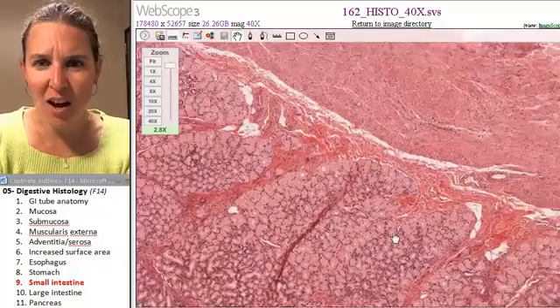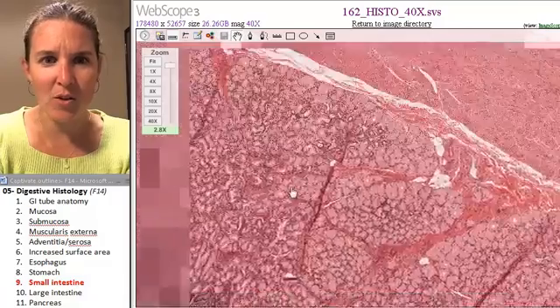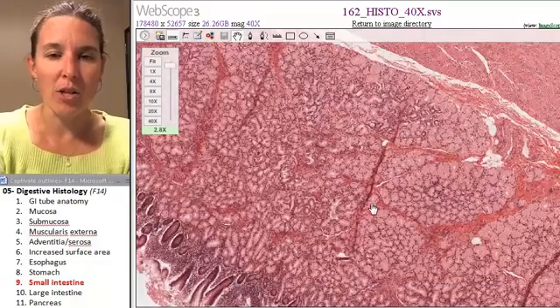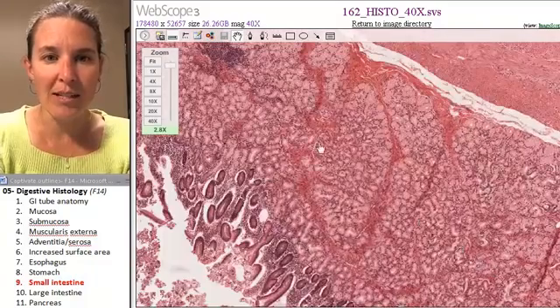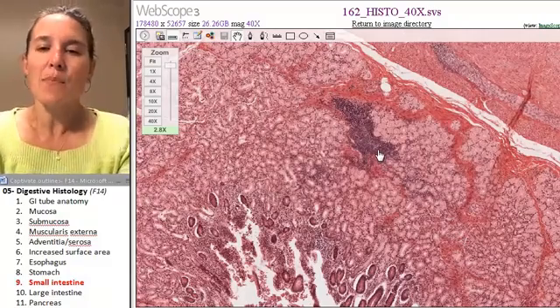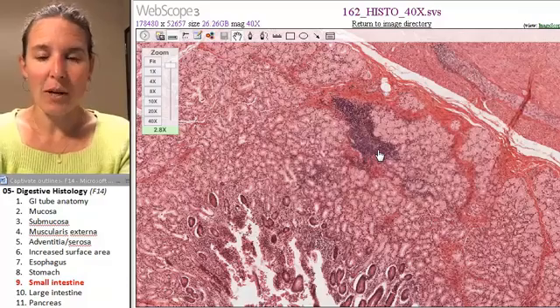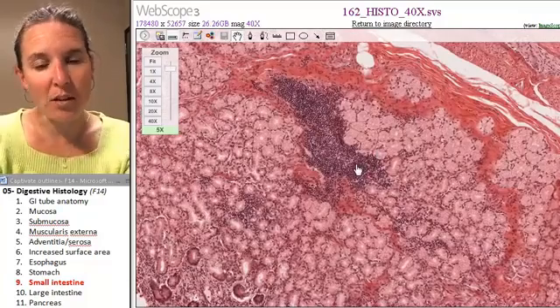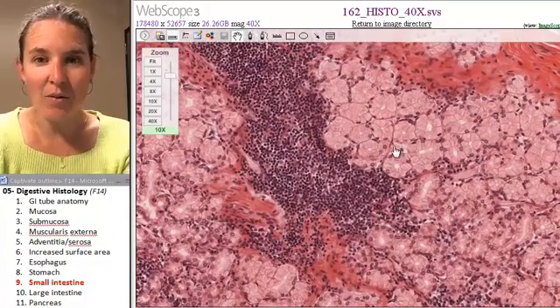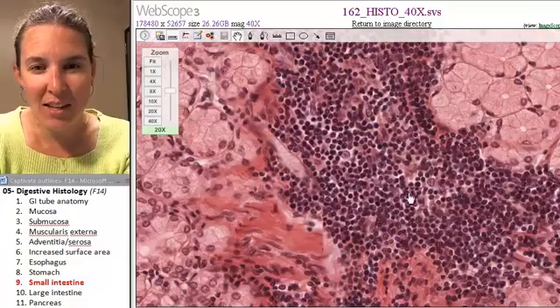I just saw a lymphatic nodule in the duodenum, and so I want to show it to you so that you can get a sense of what it looks like. Check it out. This is awesome. Don't go by color. Never go by color when you're studying histology, but look at the shape. These are my duodenal glands all over in the submucosa. Look at this.